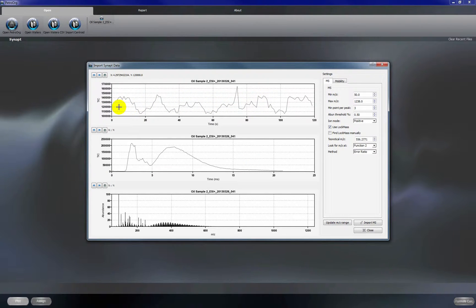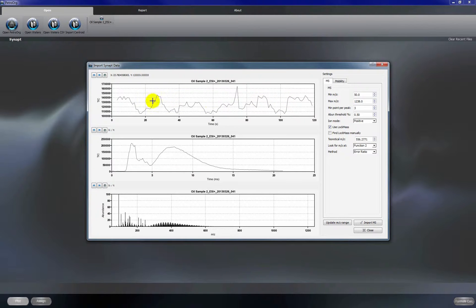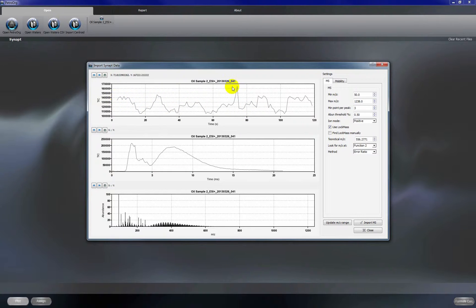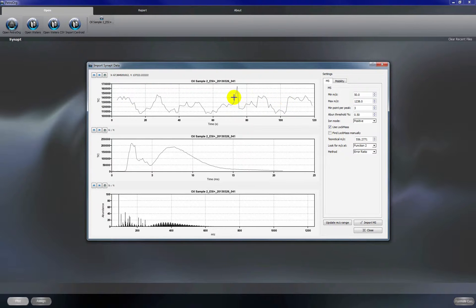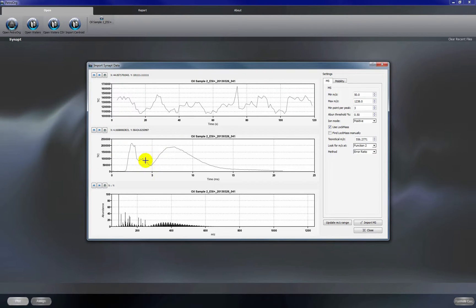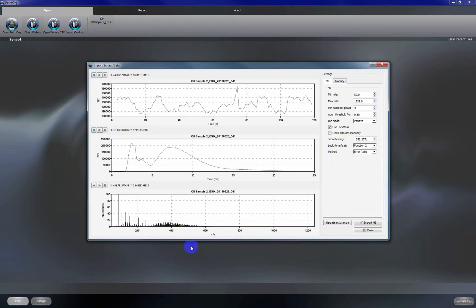This top box has the chromatogram if you're doing LC-MS. If you're doing direct infusion then this is just the chromatogram of your direct infusion which is essentially the number of scans and the acquisition time. The middle box shows us the mobilogram for the entire sample and the bottom box shows us the mass spectrum.